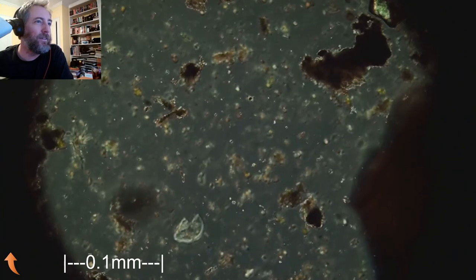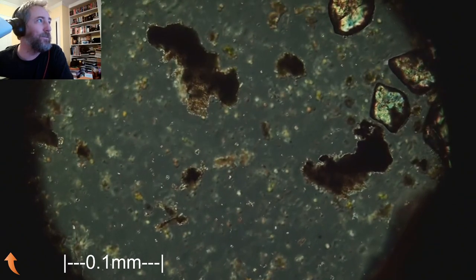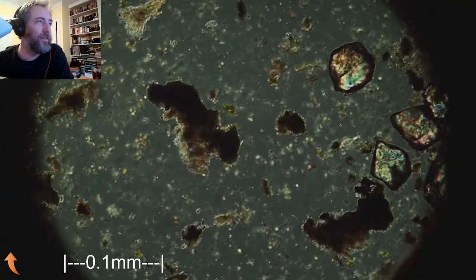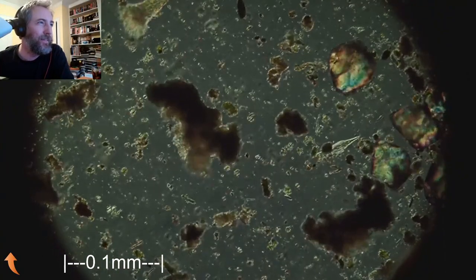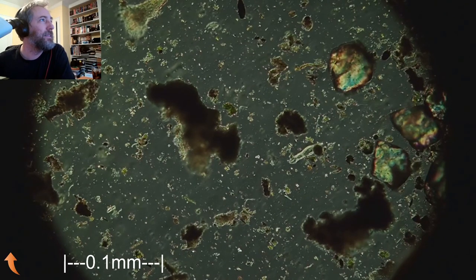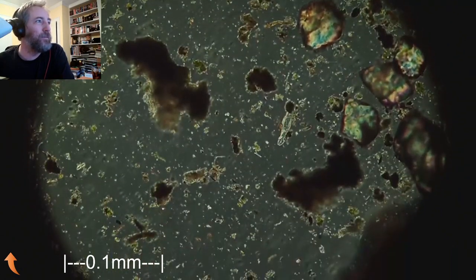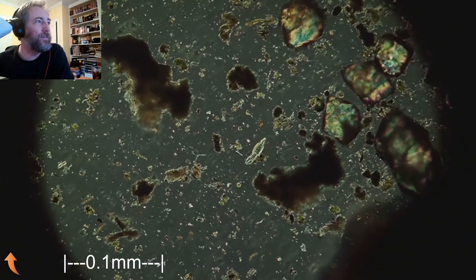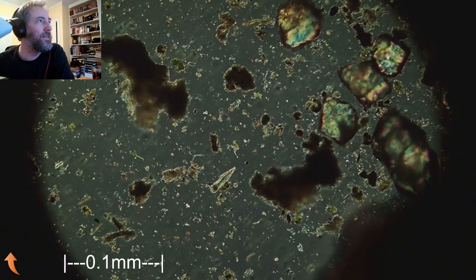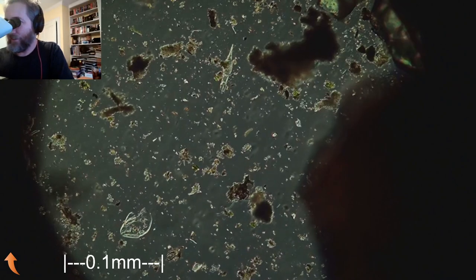Nukasine, this is actually from some sticks that I collected from the roof of my house and from my driveway. A sort of combination of lichen-covered sticks from two different places. It looks like it might be from my pond, though, because there's nematodes and rotifers. But nope, just stuff that was living on some sticks.